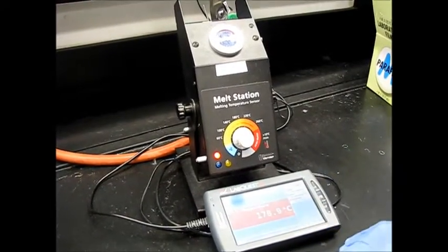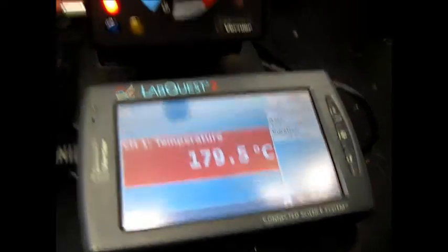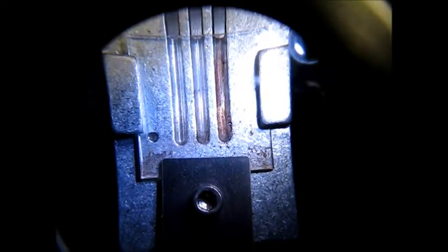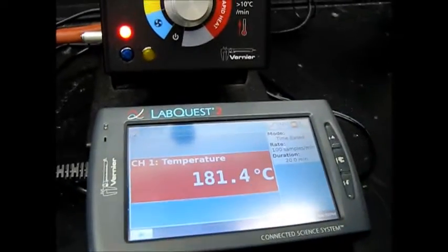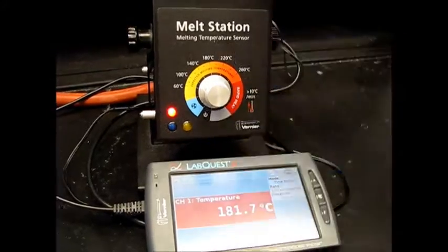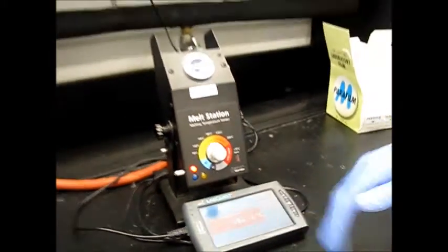So it just started melting. It was at like 176. So it's a little bit higher than expected, quite a bit higher. I don't know if you're able to see this very well, but it is almost done melting by now. Yeah. So you'll go ahead and call it there. It was probably like 180, 181 where it really fully melted. So we have a somewhat broad melting point range and somewhat higher.